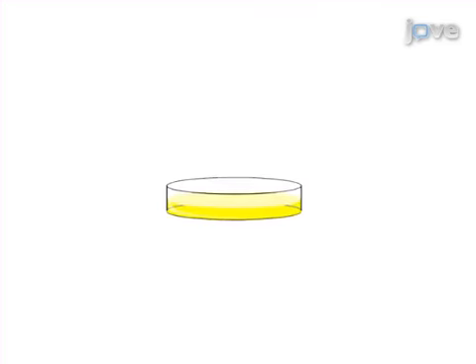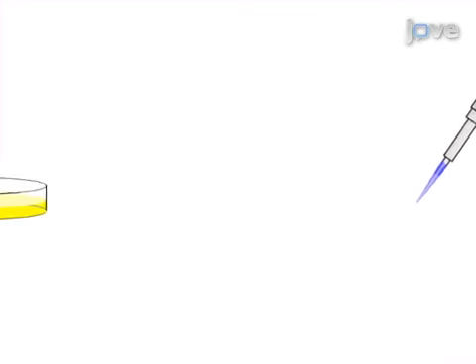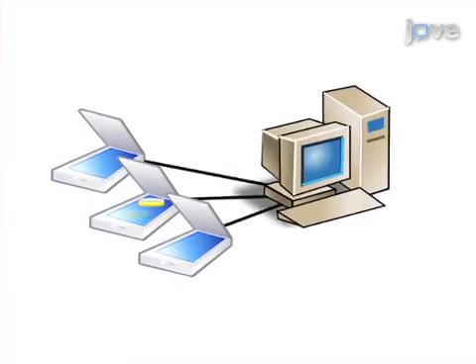The second step is to plate a defined colony-forming unit of bacterial culture onto petri dishes containing conventional nutrient agar. Next, the dishes are placed into engineered holders on the scanners and time-lapse images of the colonies are taken with the scanners.